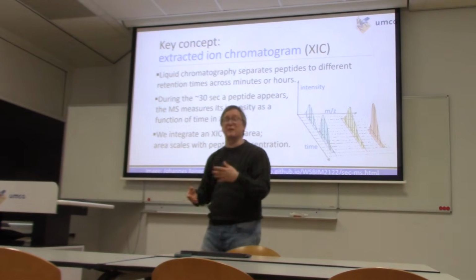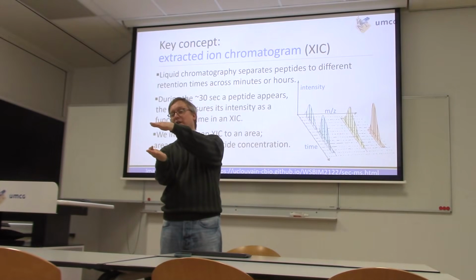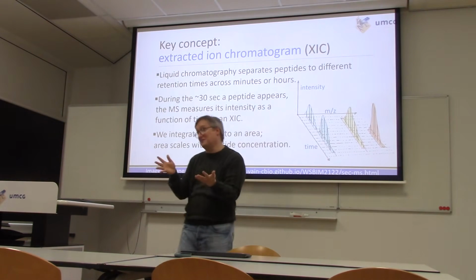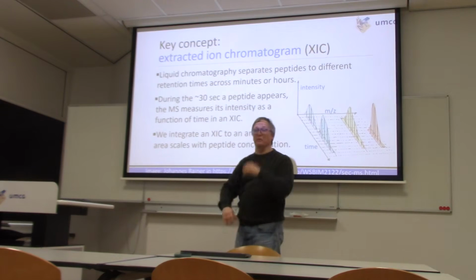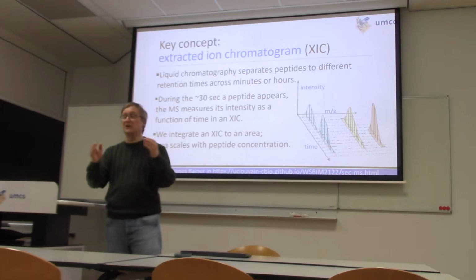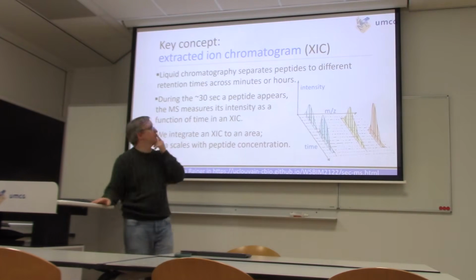But then we would need to think about things like linearity. If the signal that you receive for an ion doubles, does that mean there's twice as much of it there? If you're in the region of linearity, yes. If you're outside it, no. So let's talk then about how intensity values become quantities and what we're doing to rearrange mass spectrometry to make it easier to get stable intensities, thus stable quantities.